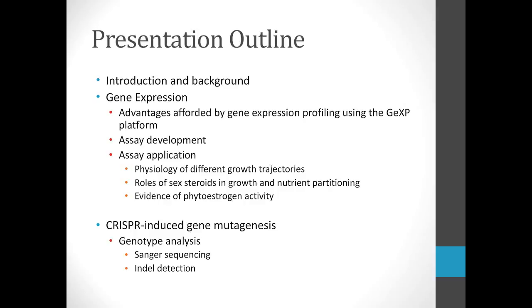But more time will be spent discussing some of the gene expression profiling that we've completed using the GeXP platform, specifically focusing on assay development as well as how we've applied these assays in different studies utilizing rainbow trout. And then finally, I'll finish up with some recent work on CRISPR-induced gene mutagenesis, particularly how we've analyzed genotypes using the GeXP platform.